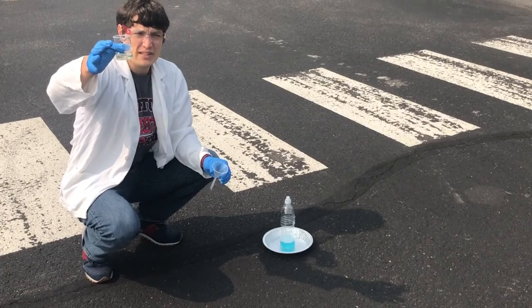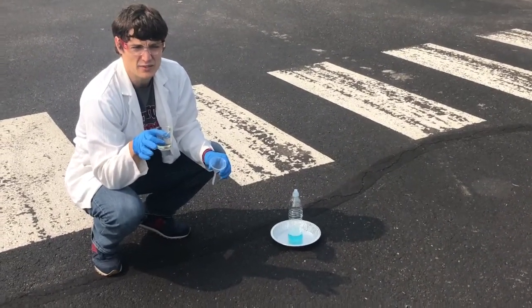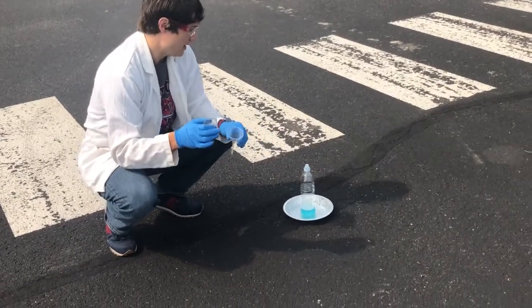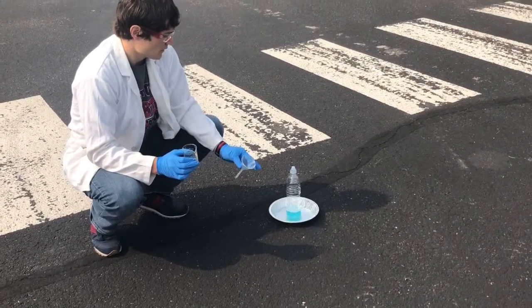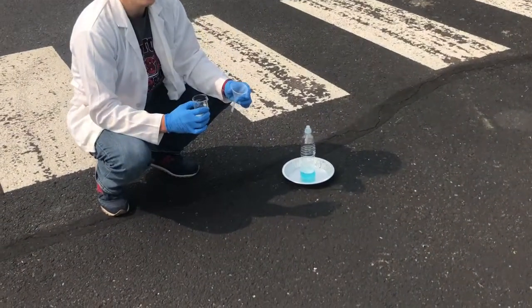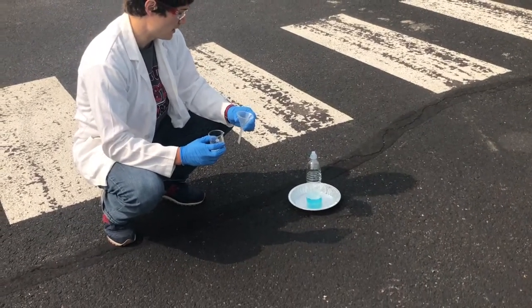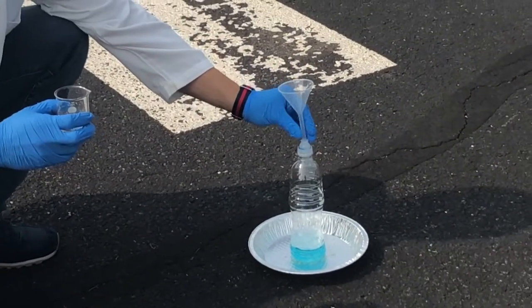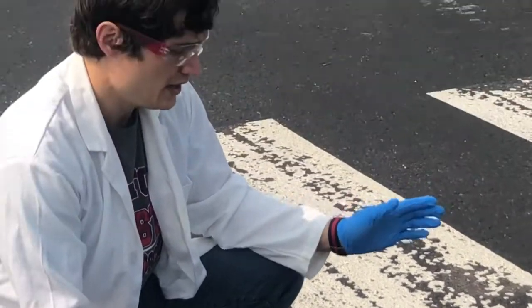Potassium iodide is our catalyst for this reaction. Potassium iodide is made of two different atoms bonded together: potassium and iodine. And then we have our H2O2 — two hydrogens, two oxygens — in our bottle here. I made this bottle just because I want you to be able to see the reaction a little bit better. We could do this in a beaker, but it's just kind of better to do it like this. We are planning on pulling apart those H2O2s to make H2O and O2.